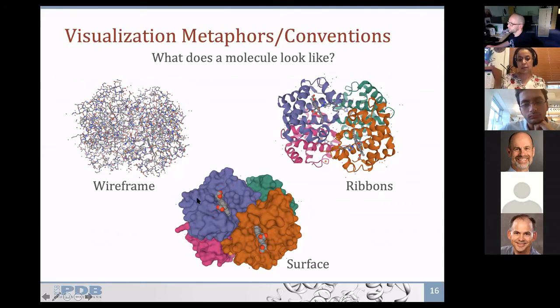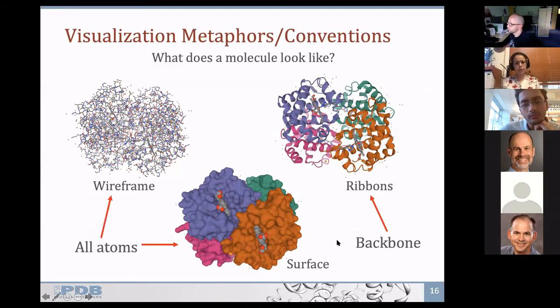And that's the heme bound to each of the 4 alpha and beta globin chains. So if you just remember this metaphor, you can have all atom representations or only backbone representations. You can have ball and stick or surface representations.